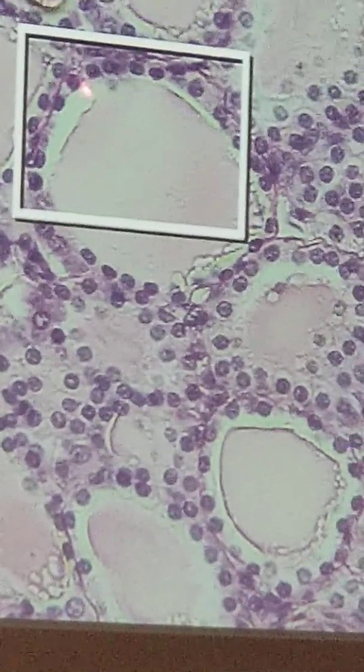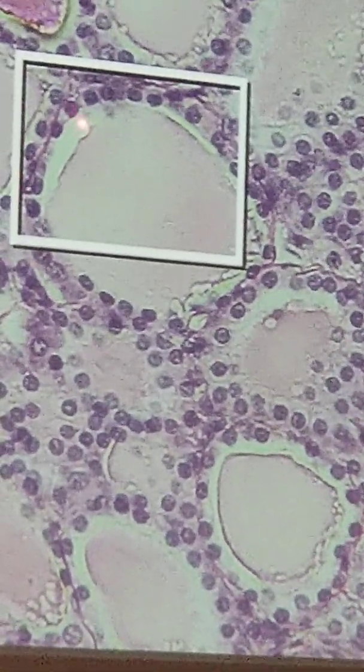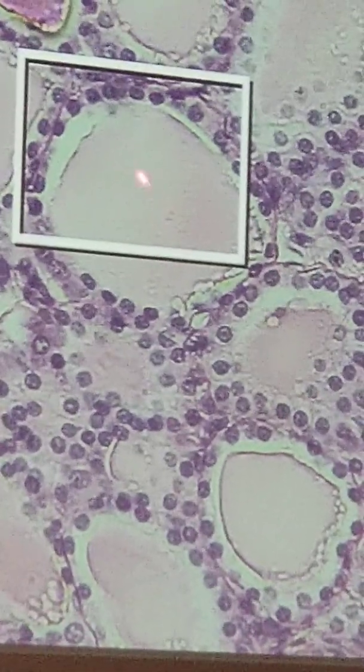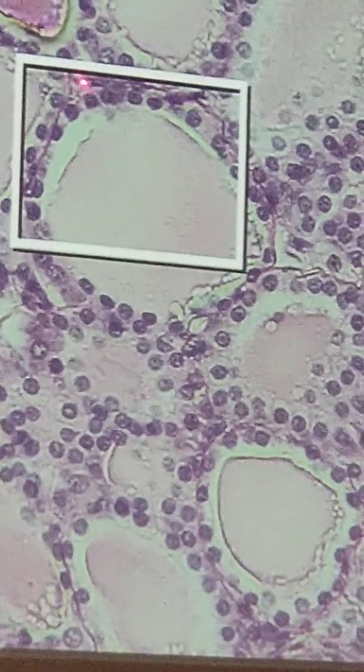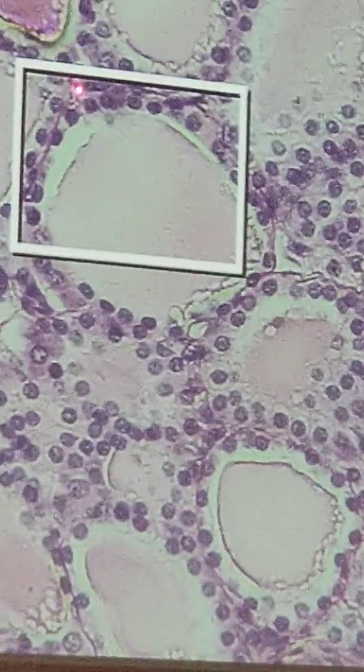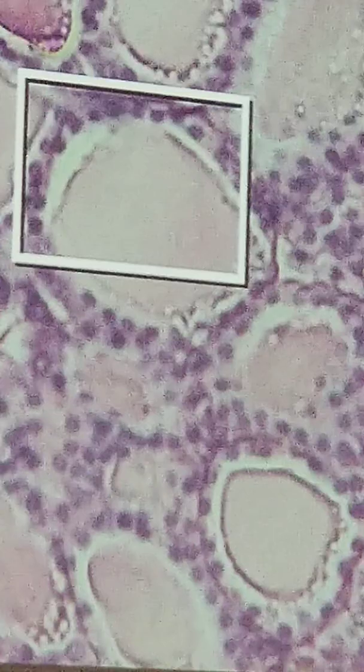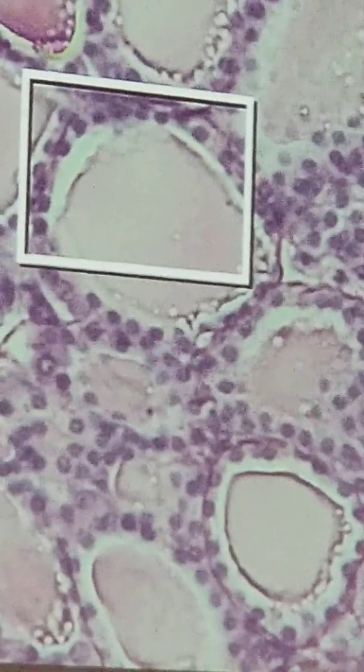So this is the lumen. So what surface is this, right there where the pointer is? Apical surface, because there's free space here. So right here would be the basal surface. And all this in here, next to it, would be connective tissue. Okay? So on your outline, you've got basement membrane, lumen, put the next slide in.